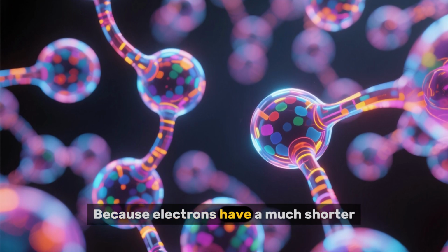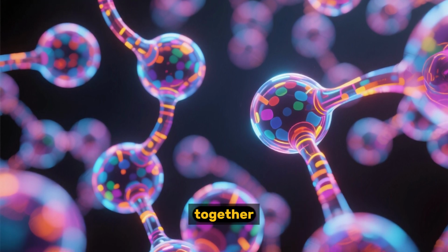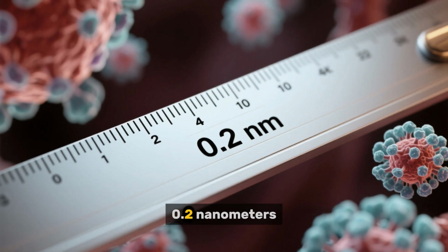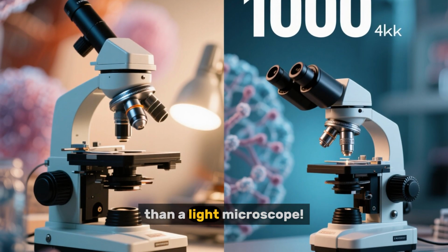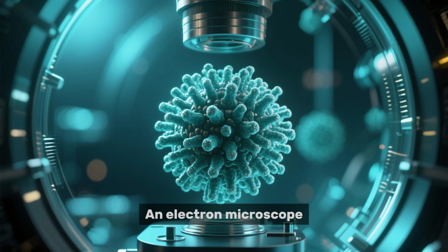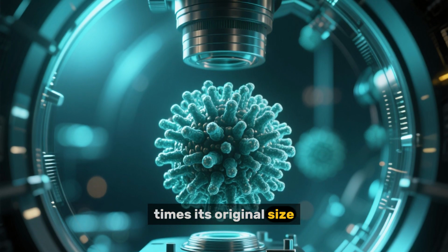Because electrons have a much shorter wavelength than light, they can resolve things that are incredibly close together. The resolving power of an electron microscope is an astonishing 0.2 nanometers. That's over 1,000 times better than a light microscope. And the magnification, it's almost unbelievable. An electron microscope can magnify an object up to 2 million times its original size.